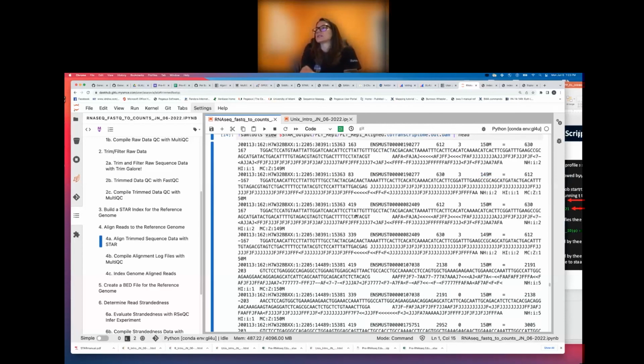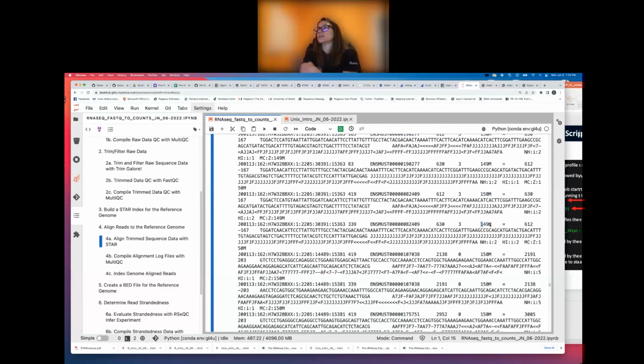This one here, again, it's the same read, so it should be the same length. Since all these are matching, we do show again that all 150 base pairs are matching to this transcript for this read, and for its mate, all 149 base pairs of the respective reverse read are matching to this transcript.